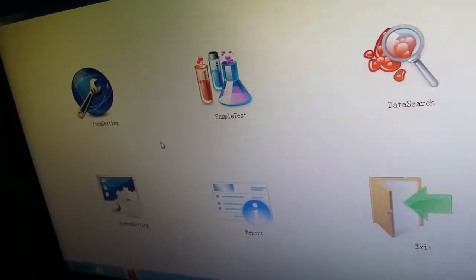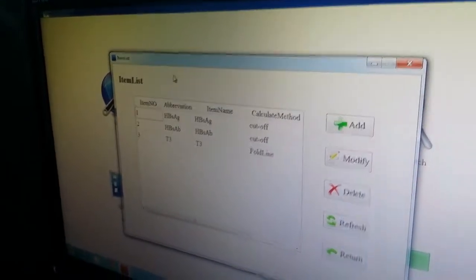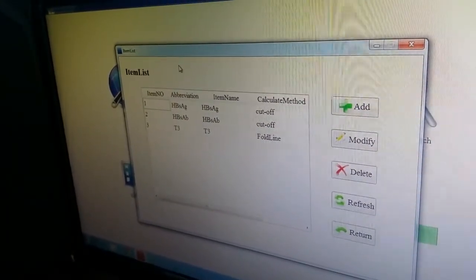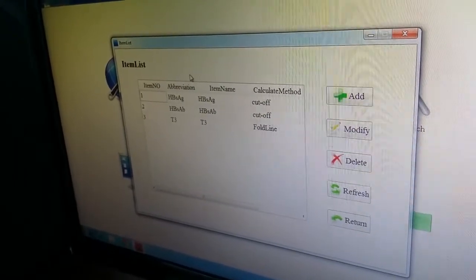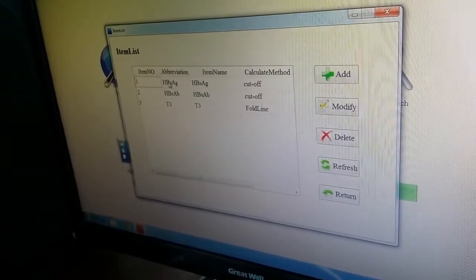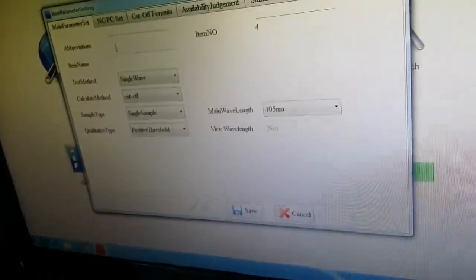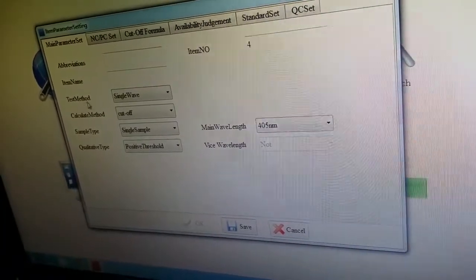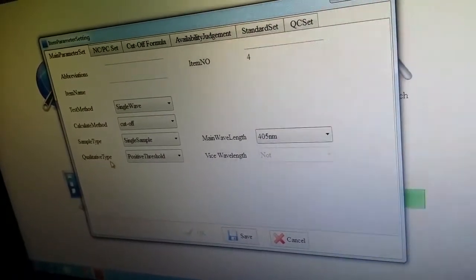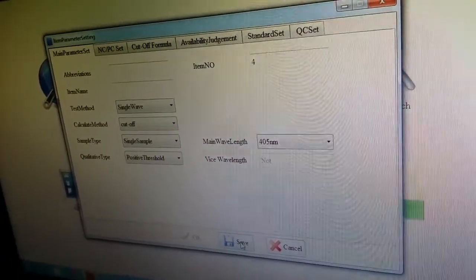Now let me show you how to configure an item. From here, you can add or delete items from the item list — whichever item you want to add or remove. Let me show you how to add an item to the list. You click Add, then enter the item number, and choose the test measure or calculate measure — same type, qualitative type — and set the wavelength. Then press the Save button and it will be done.